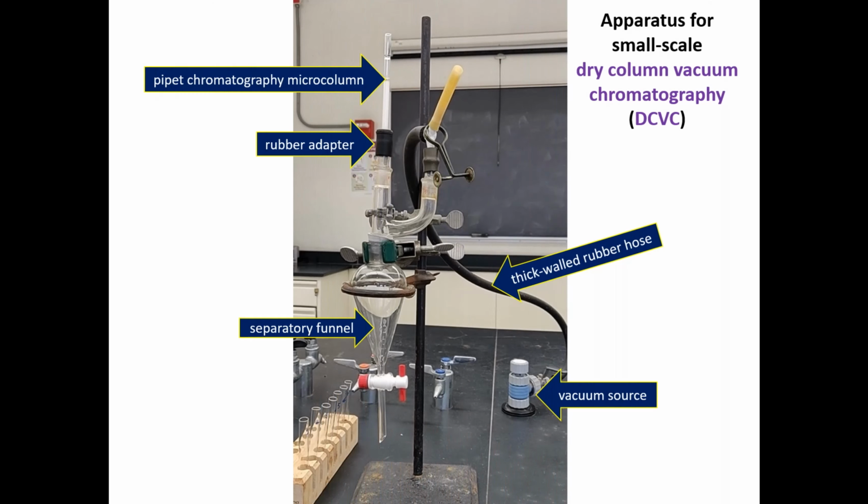Instead of using either gravity or air pressure to separate and elute pigments from the column, you might be asked to separate the pigments using a technique called dry column vacuum chromatography, which uses vacuum pressure to rapidly pull the eluent down the column, affording a quick and easy separation of a mixture. This technique is demonstrated in a separate video, which you should view regardless of whether you are assigned this method to separate plant pigments.